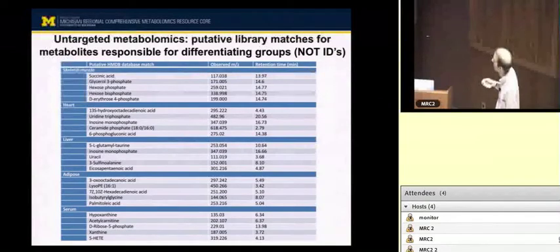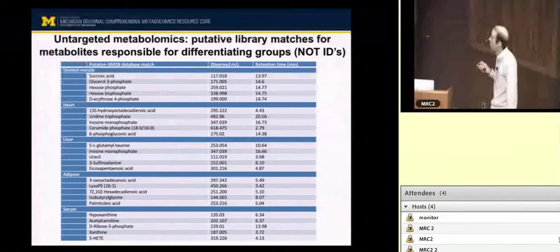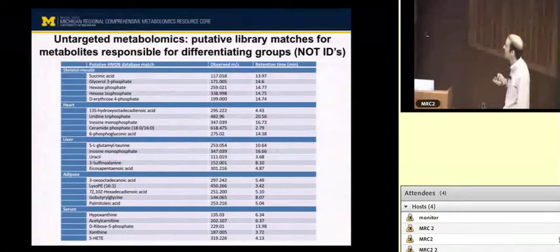Here again, we see some in liver. It was a little bit different. We see some nucleotides. Again, we've got a fatty acid and adipose tissue, various other lipid species. In serum, we have hypoxanthine showing up, xanthine, another nucleotide breakdown product. Some, a pentose phosphate pathway intermediate, which is a little bit unusual, although they are present in serum. So we have a range of different metabolites changed.